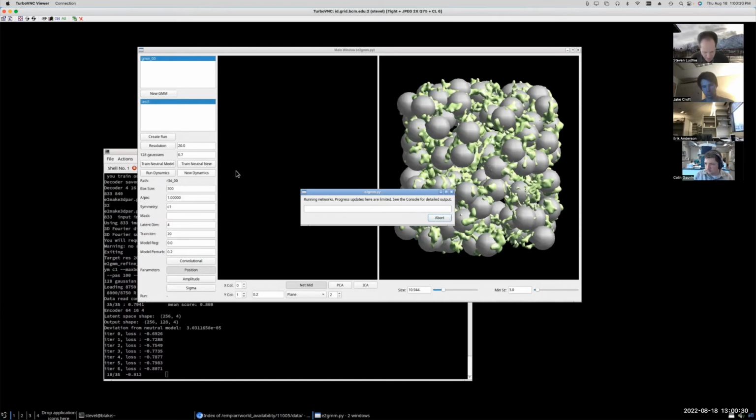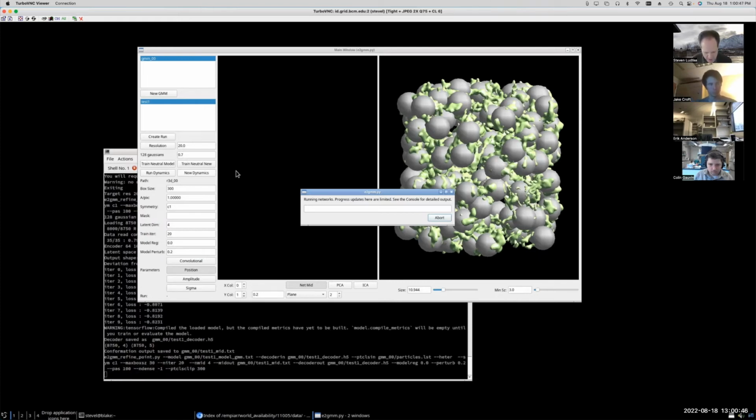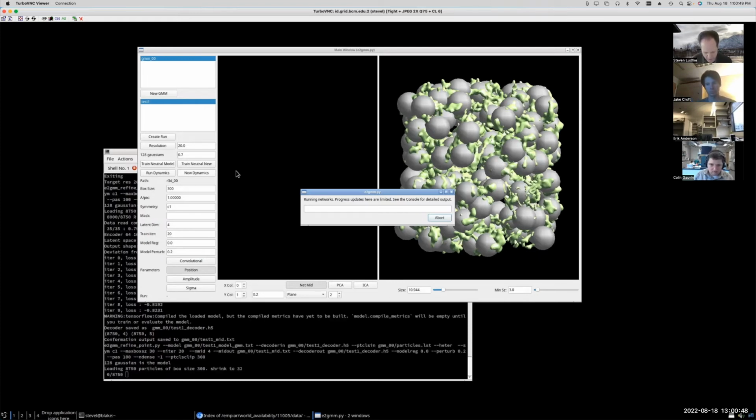Unfortunately, you can't tell from the numbers that we're seeing here whether it's going to do something useful or not. What I've seen in the past when I've tried to run these with simulated data is either it succeeds very nicely or it fails entirely.